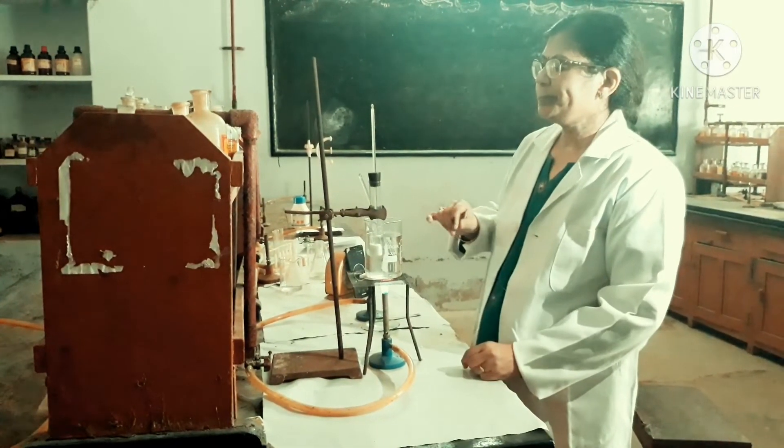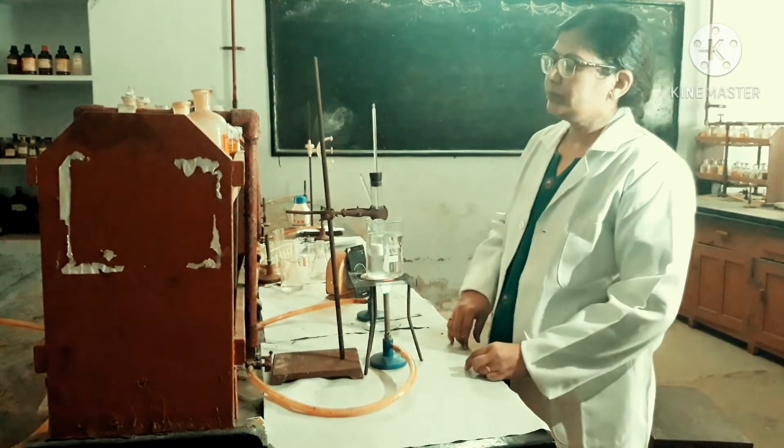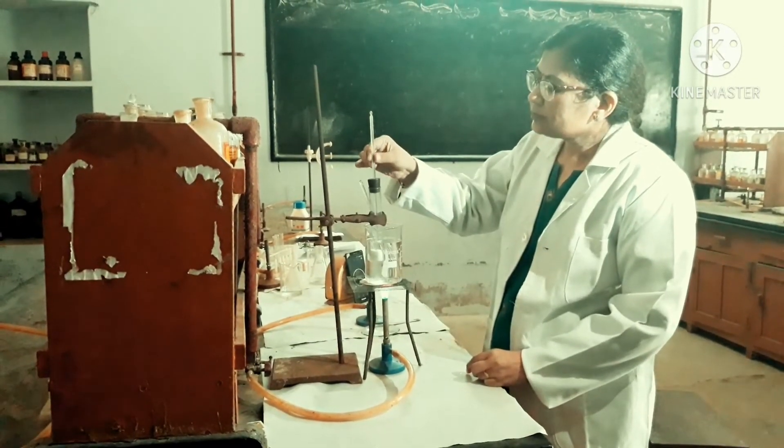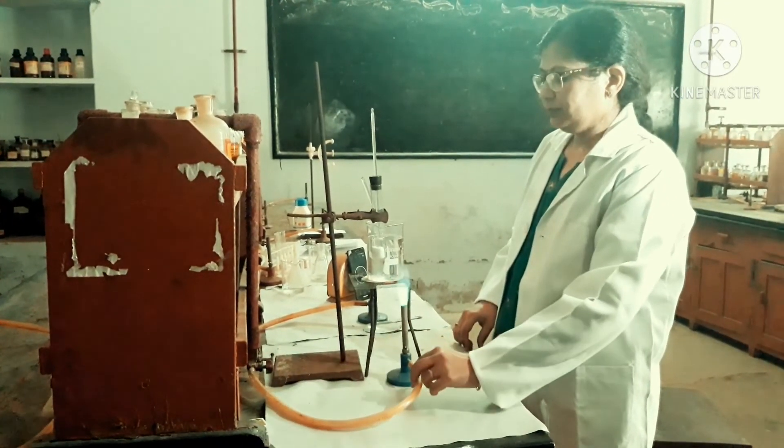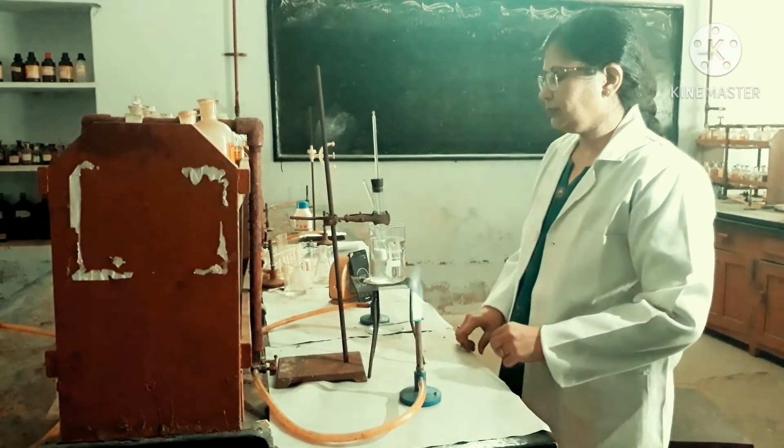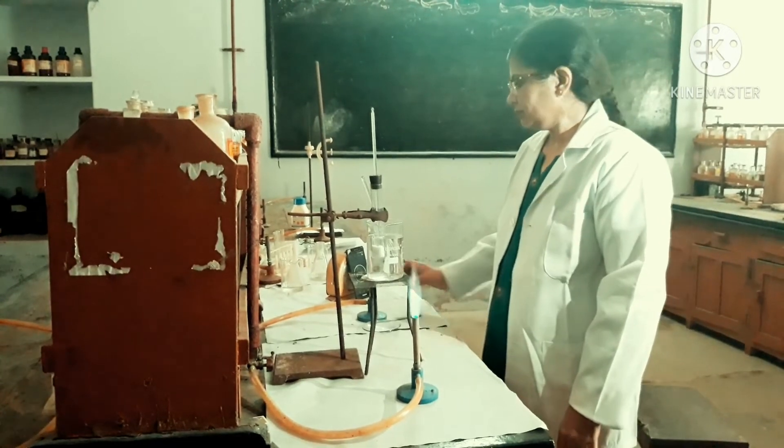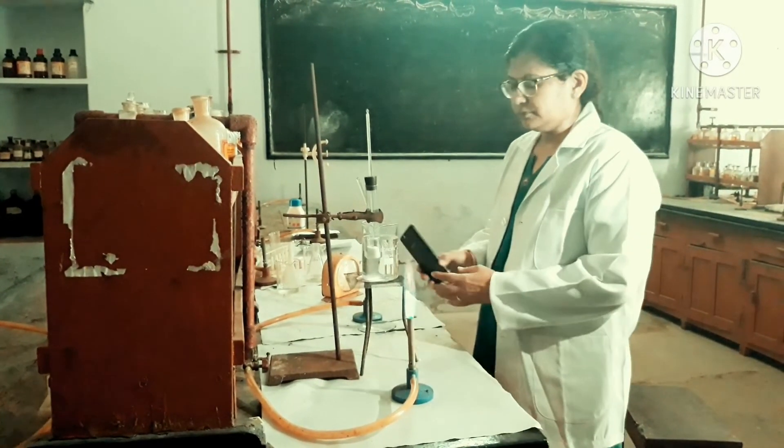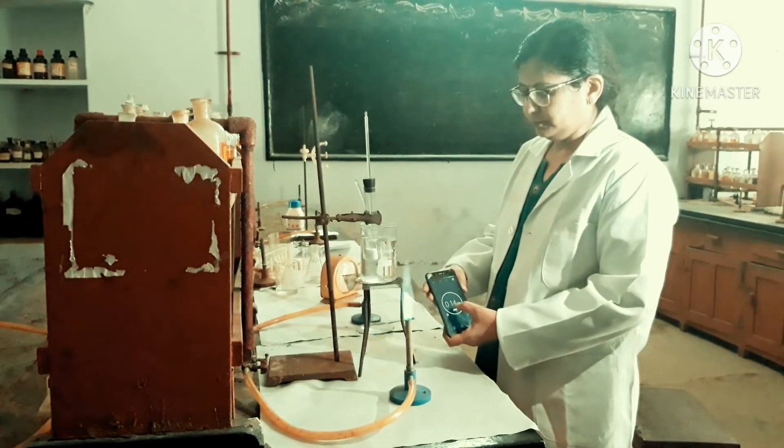Continuously note the temperature of the thermometer up to 70 degrees Celsius per minute. Remove the burner and allow the temperature of the substance to fall down. Again note the temperature reading during cooling from 70 degrees centigrade per minute.